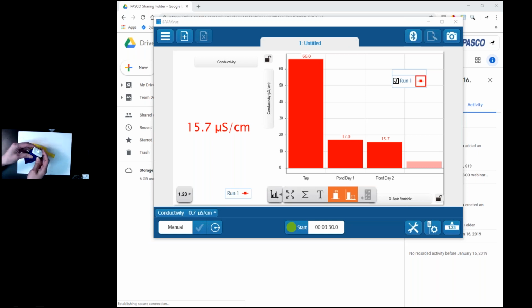So I took a balloon, worked my fingers so that I could open it super wide, and got a second person to help me shove the sensor into the balloon, and then I pulled the top over the opening. Make sure that the opening is at the top like this so that it can read without getting blocked when we do an activity with a balloon.